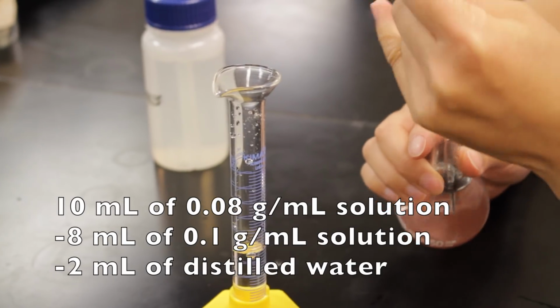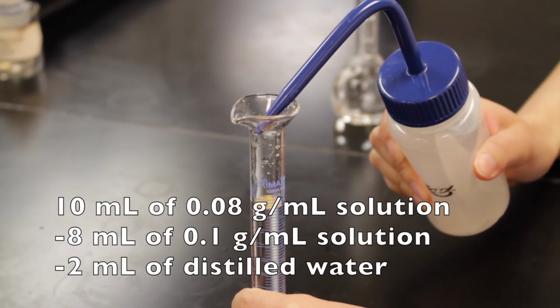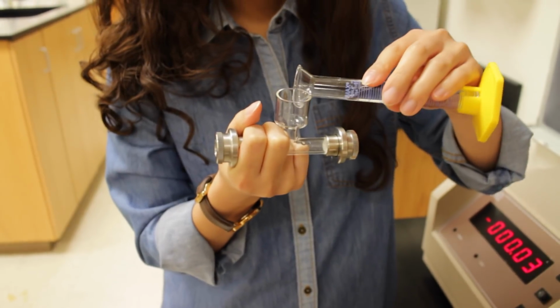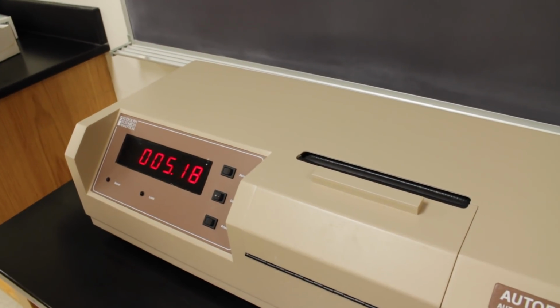From the calculation, you add 8 milliliters of 0.1 gram per milliliter solution and 2 milliliters of distilled water to make 10 milliliters of 0.08 grams per milliliter solution. You don't need to calibrate the second time. Add the solution into the cell, place it, and record the number on the polarimeter.